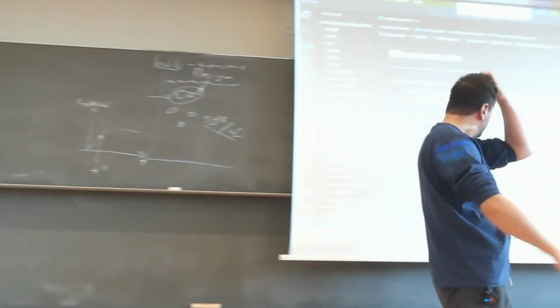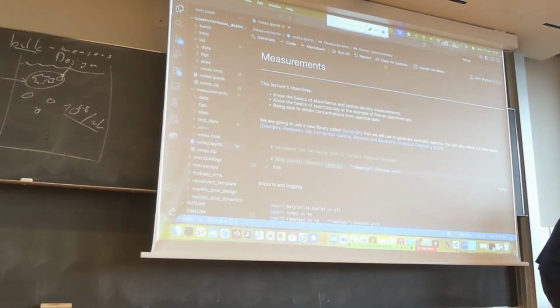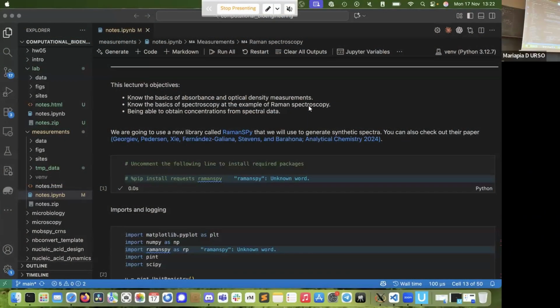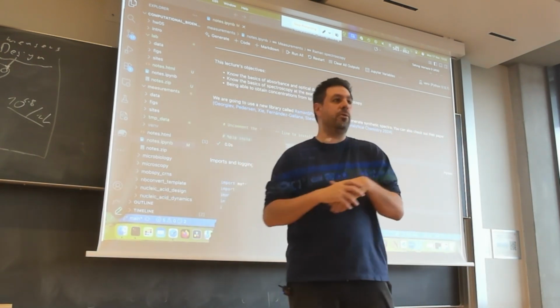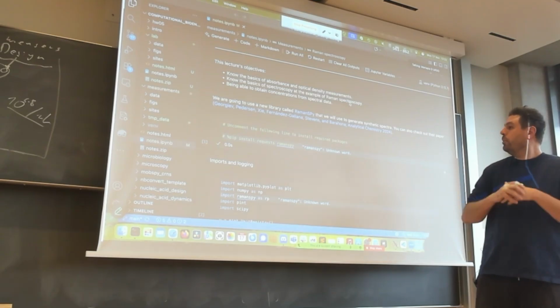So let's take a look at the online material. We will be using a library that is called Raman Spy. That's actually a quite nice library that comes along with links and tutorials to very interesting data sets, and this is why we picked it.